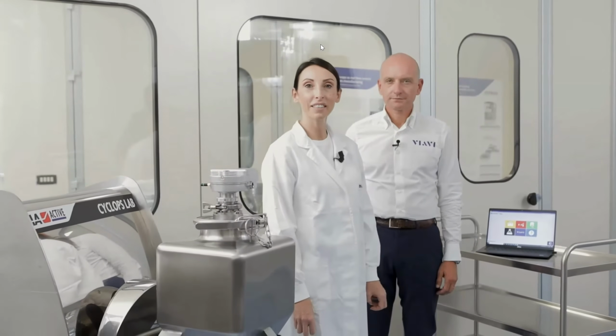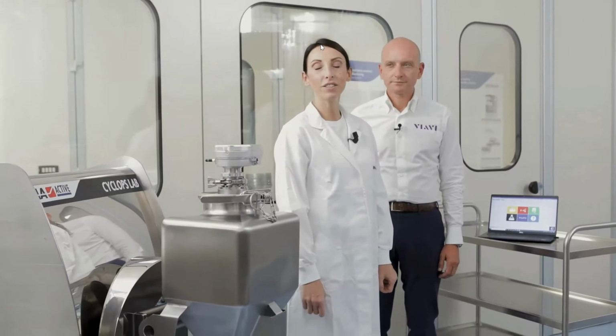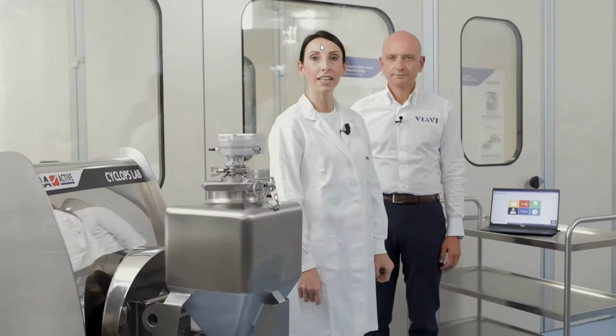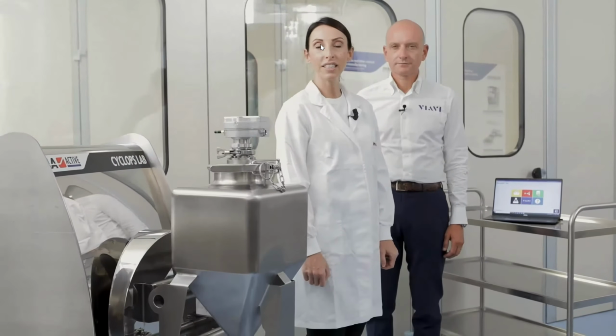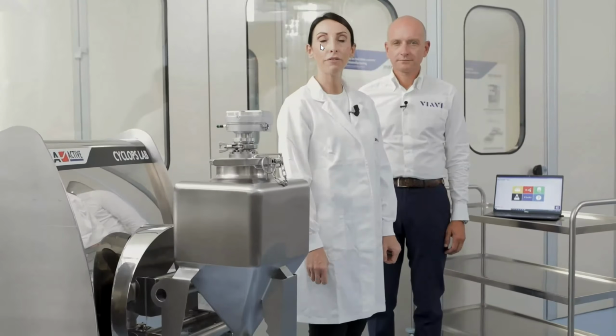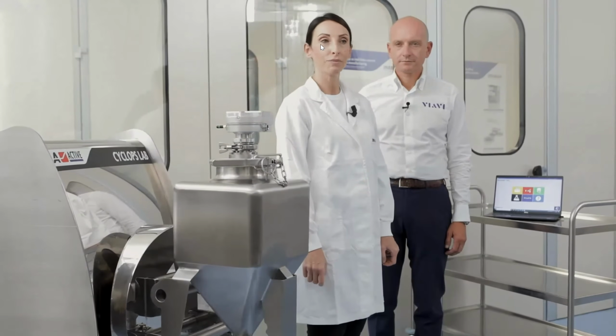In a lot of cases, it can happen that the blend is not as homogeneous as desired, and also the final properties of the blend are not in the specification. This, of course, can increase the time for both process and formulation development.